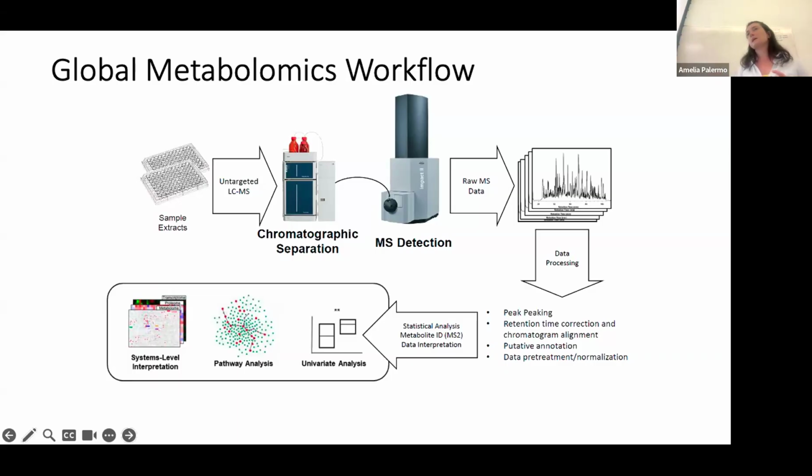From that, you can get a sense, especially when you project that onto specific pathways and you have changes that are very consistent across pathways, of what the overall part of metabolism that is changing is. However, it's not an identification. So your confidence in your results is still preliminary and can just help you generate hypotheses. It needs validation later on in the pipeline.